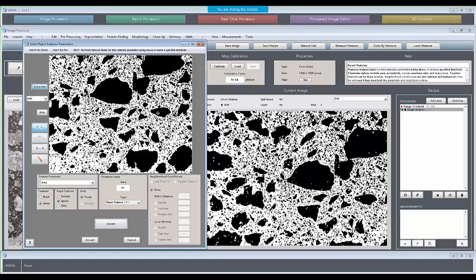That could be risky because sometimes you've got a massive landlocked white feature that you don't even know is there until you remove it. So I tend to prefer to just consider all edge white features and just work with finite size cutoffs. But true hole filling is there in the form of ignoring the edge features and setting infinity as your upper limit.